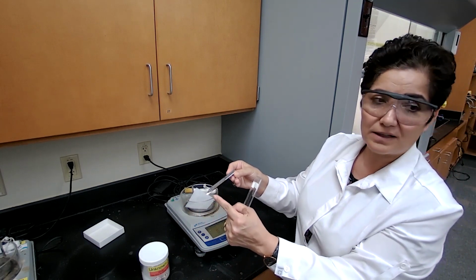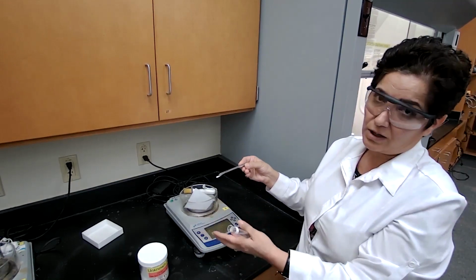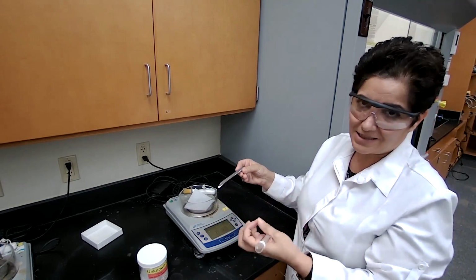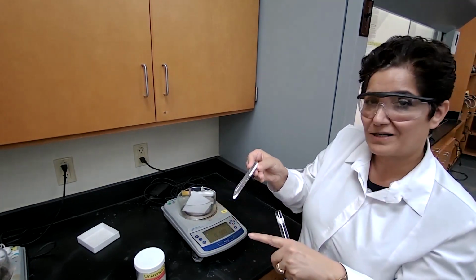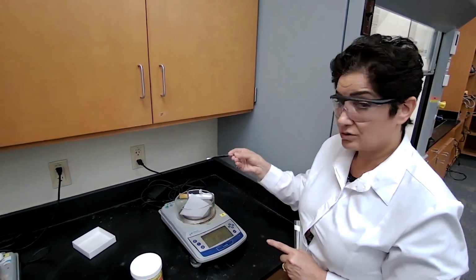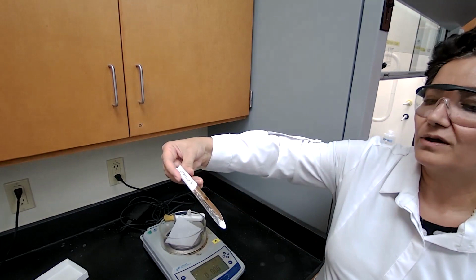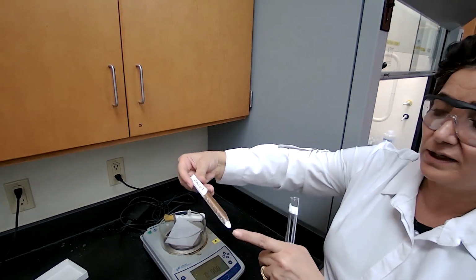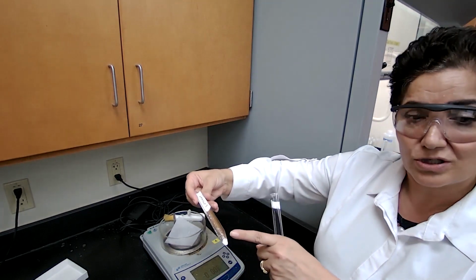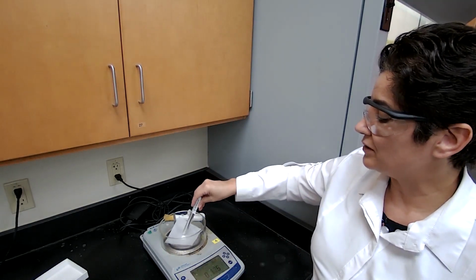It depends on the sample. Sometimes the unknown is flaky, so it might take more volume. Other times, if it's compact, it takes less volume. But this is what I mean by a tip of a spatula. So I'm going to show you that this is about 0.1. This is the amount, a tip of the spatula, for unknown 3. For the next solubility test, I'm just going to take about this much of the sample.